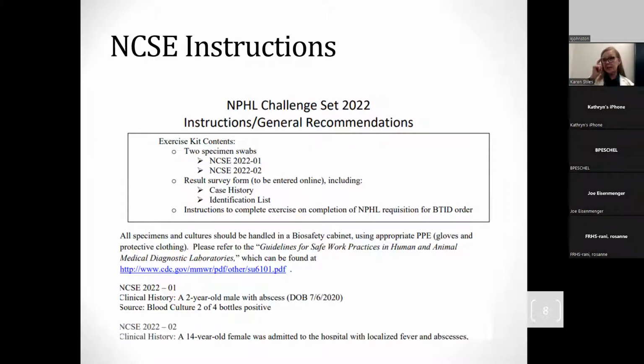What we call it is, in your setting, you are working in the BSL-2 laboratory. However, when you have situations like this, you have COVID come up, you have monkeypox, heavens forbid you have an Ebola patient walk into your hospital, and the patient, he or she, is too afraid to say anything. So here you are working with organisms.